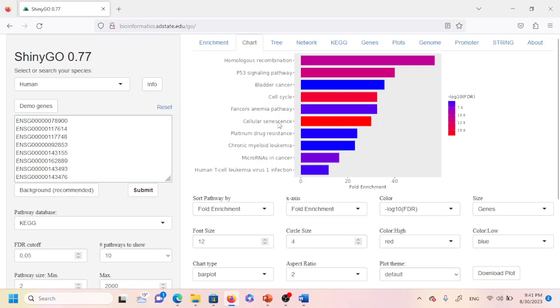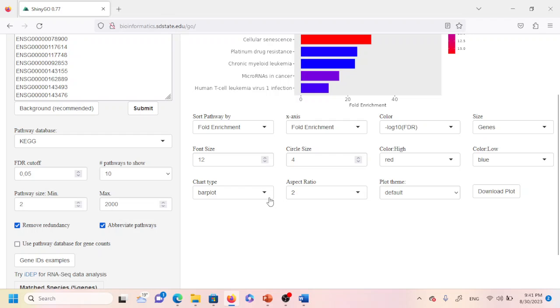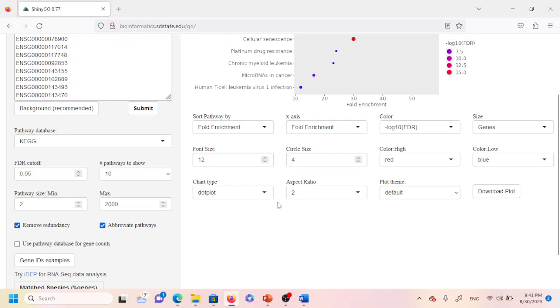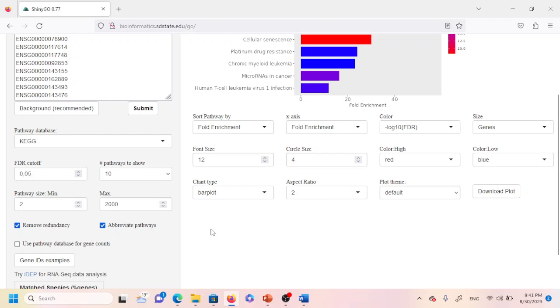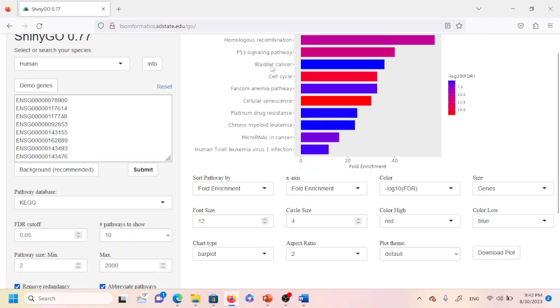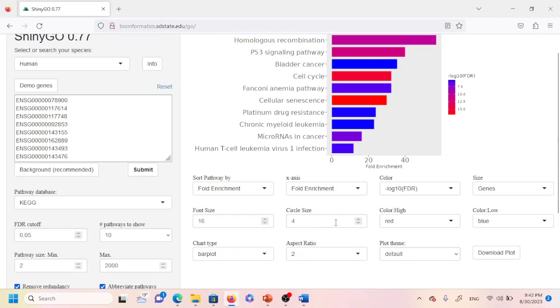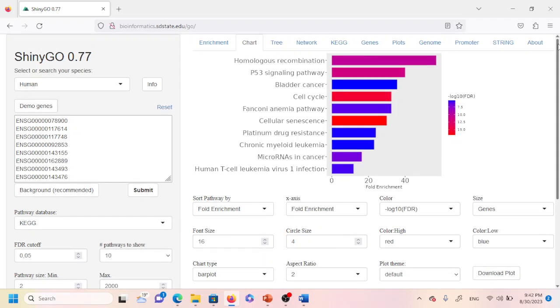These are the different pathways — homologous recombination, p53 signaling pathway, bladder cancer pathway — associated with the list of genes provided. You can also change the graph type; for example, you can switch to a dot plot or a lollipop plot. For this demonstration I'll keep it as a bar plot. You can also adjust the font size and the color scale — red for high and blue for low — to whichever you prefer.